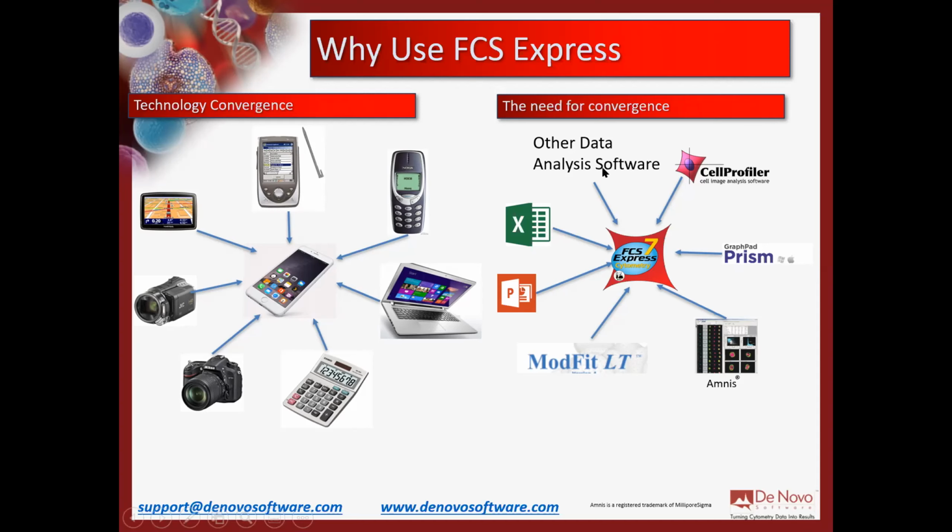Generally, you're working with some sort of third-party tool, or even Diva or FlowJo or Cytobank or whatever, and then you do a lot of copying and pasting out to Excel, copying and pasting out to PowerPoint, using other tools like ModFit and Prism, and if you're doing imaging, CellProfiler and other segmentation tools. What we attempt to accomplish in FCS Express is bringing all of this into FCS Express.